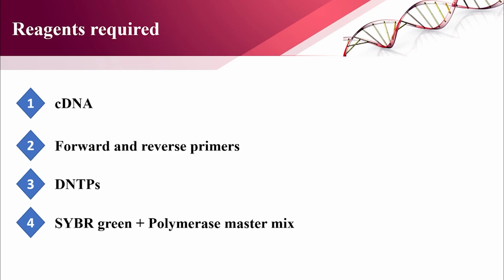Here we will talk about the reagents required. What are the reagents which are required for the qPCR? Setting up a quantitative PCR in the lab is a straightforward process. So let's walk through the steps involved.